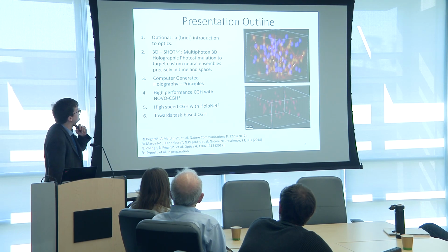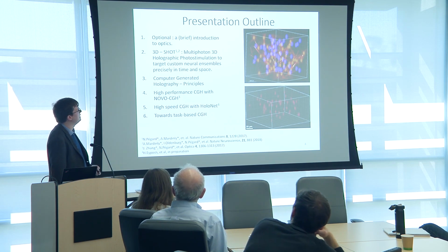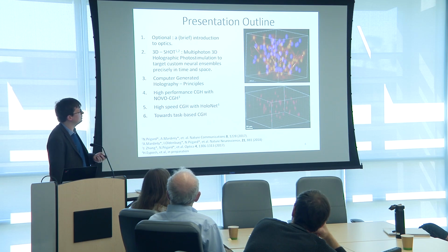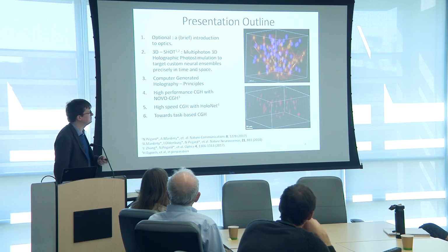So the outline for today is I would like to start with a brief and as evolved as you want introduction of optics. We can spend an hour on that, so I will try to push things forward. Then I'll talk to you about this technique that I developed when I was a postdoc at Berkeley, which is called 3D shot, that allows you to do multi-photon activation of custom neuron ensembles and has been really tailored to try to satisfy all the criteria we just seen before.